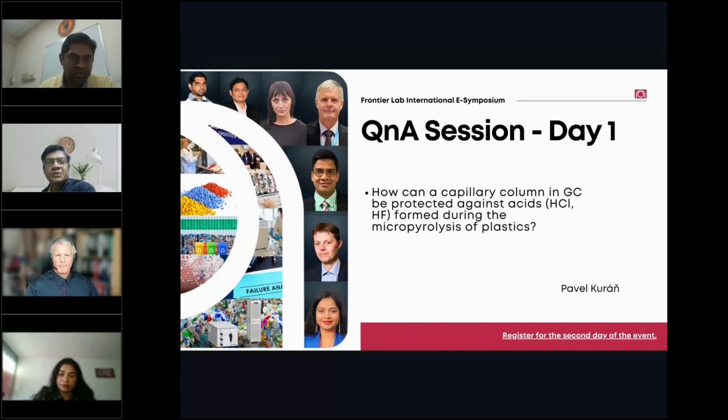I can also give my couple of pieces on this. HCl formation from plastic is quite rare, only when you have polyvinyl chloride as the main plastic. Only then you have the formation of HCl as a pyrolysis product. Whereas with most of the conventional thermoplastics which are non-chlorinated, I think this is not an issue. But only with very specific things like PVC or PVDF and so on. Sure, that's a very valid point. Okay, Asti, move on to the next one, please.